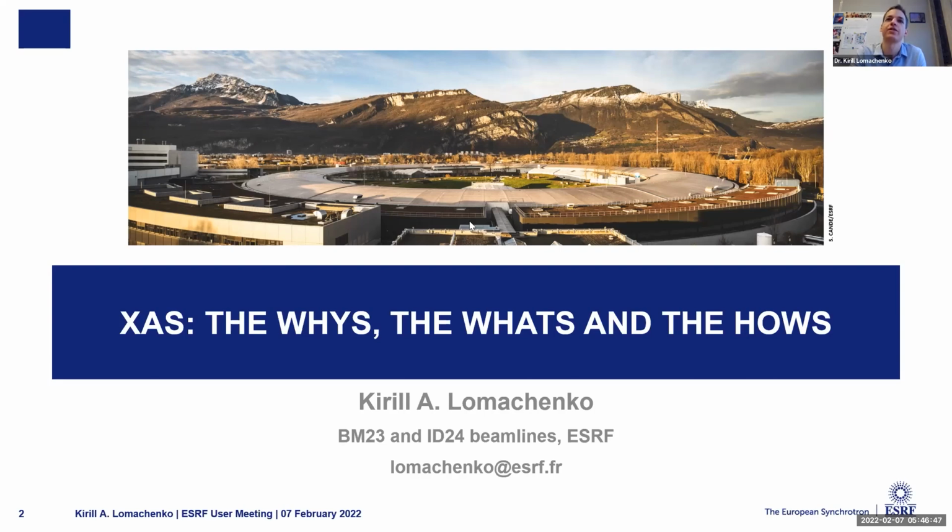The problem is that to do L edges of 3D metals, you have to go to soft X-ray beamlines because energies are pretty low. When you go to soft X-ray beamlines, it's hard to do in situ and operando measurements, although it is possible. I know that at Elettra in Trieste they can do this, but it's very difficult because you need very specialized cells. With soft X-rays, you need to be in ultra high vacuum, because otherwise you'll absorb everything.